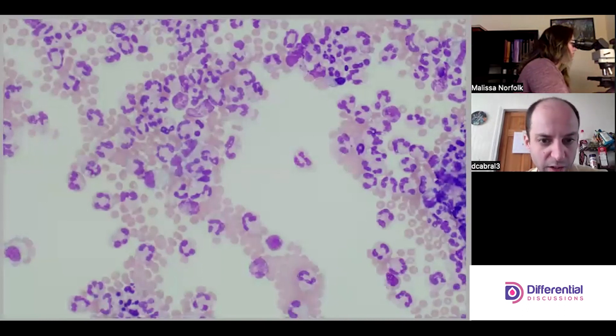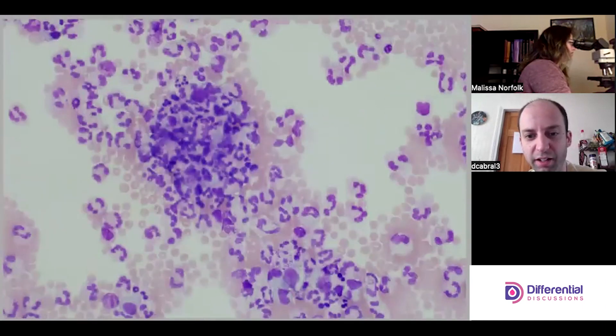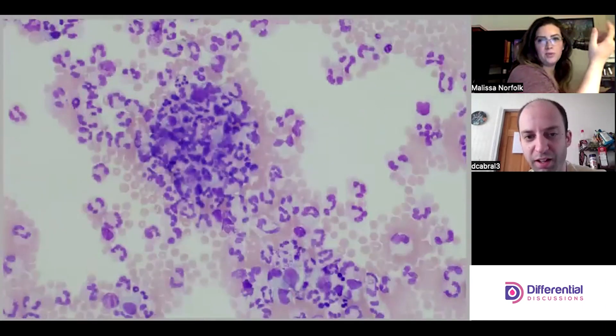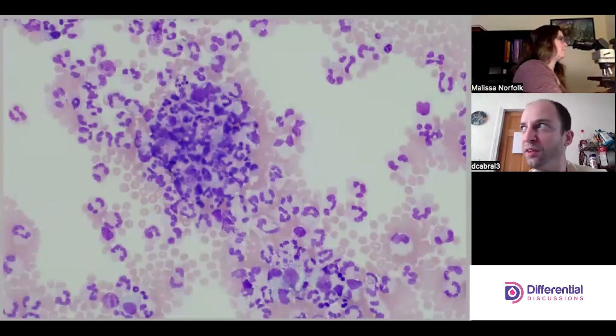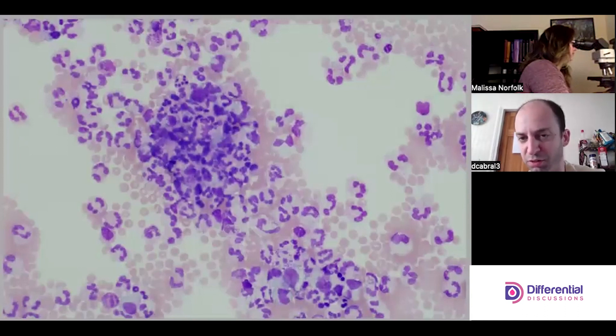We're still on 40x, so I'll drop down a little bit, but just so people can see — this is a giant clump of cells and it's really hard to actually see individual cells. We're not going to be able to see features and call them, and that's why we don't count the giant clumps. The ability to differentiate one cell from another just won't be there, so avoid those areas.